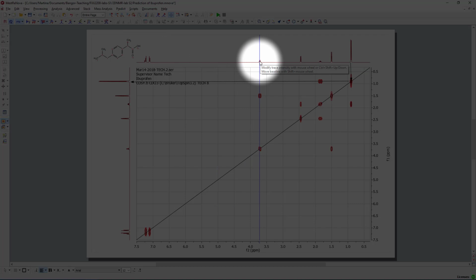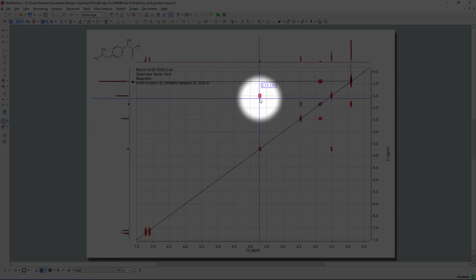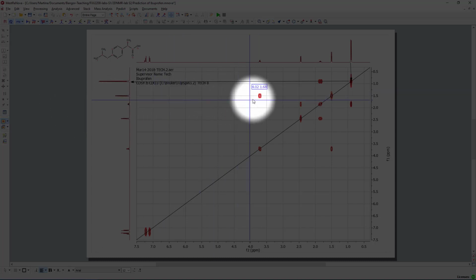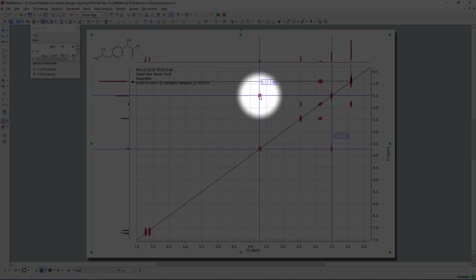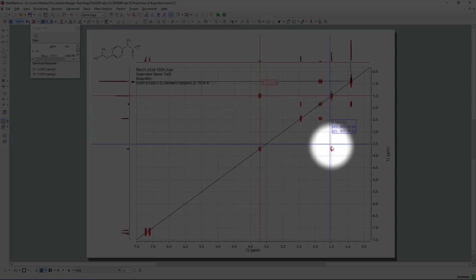We look for the CH signal and then check, it goes to itself, and now we see on this line that there is an island in between, and this island basically tells us where the cross peak is. At the moment you can see the mouse is kind of floating all the way. So the trick is to press down the shift button. If you hold down the shift button, then you get to see the whole square.